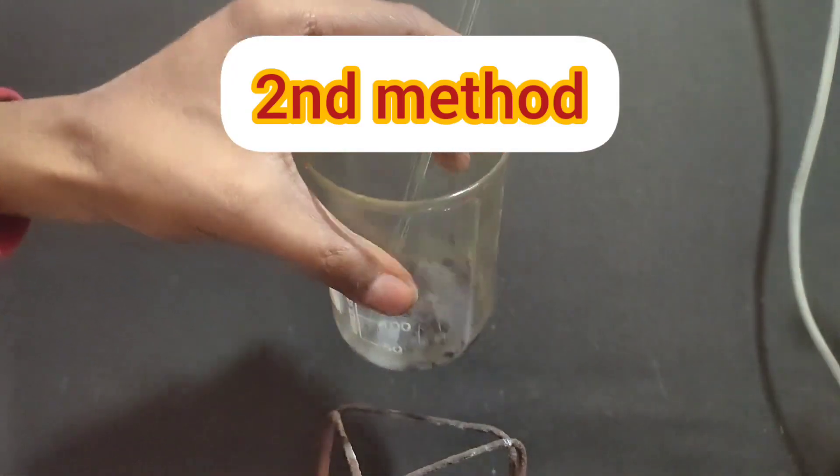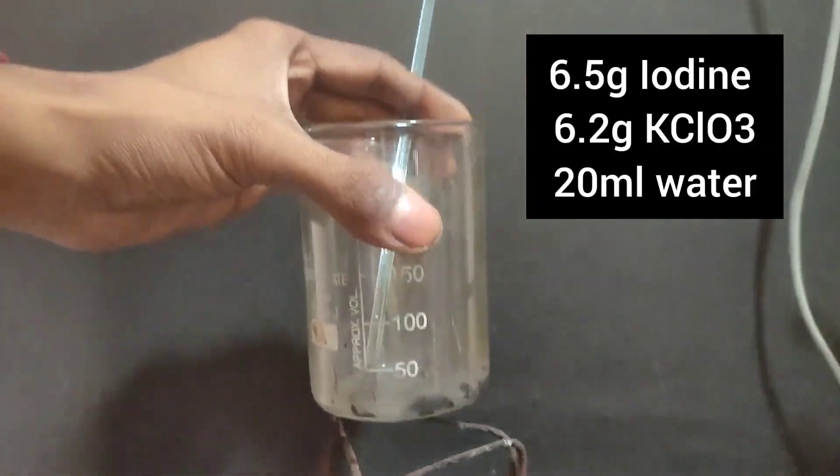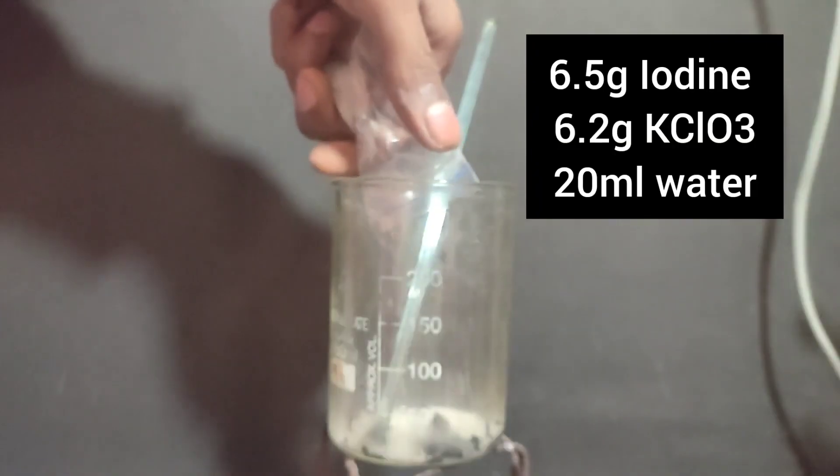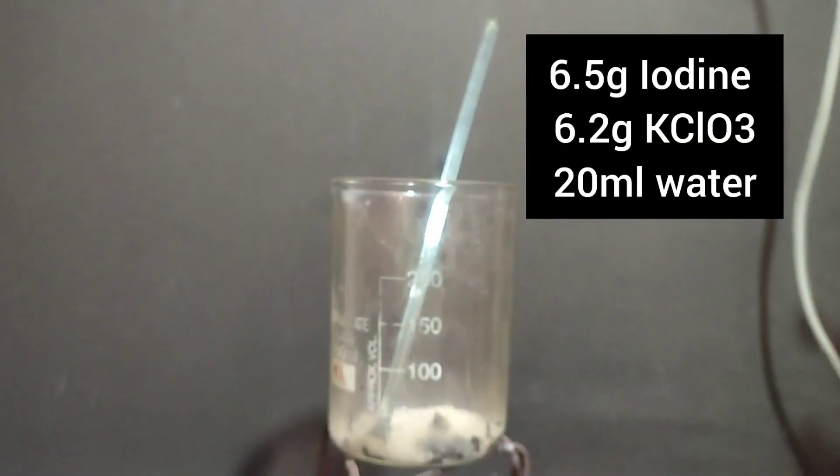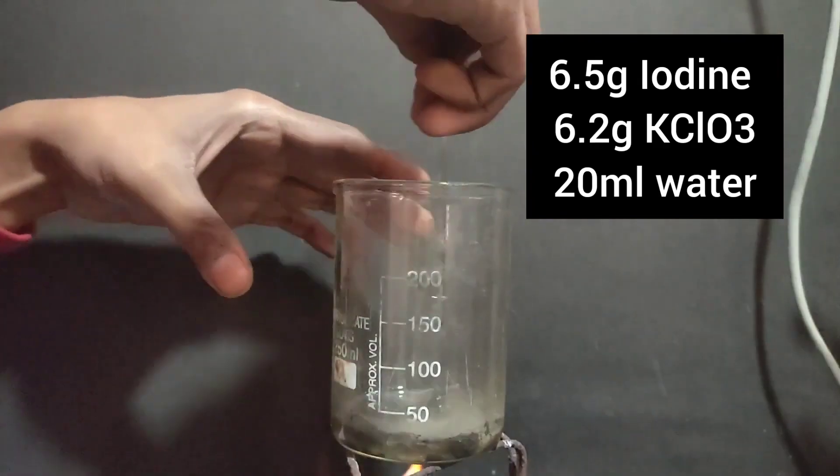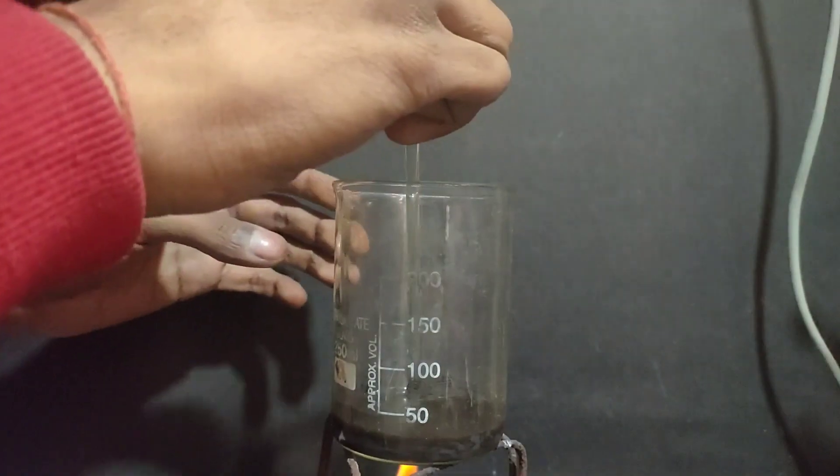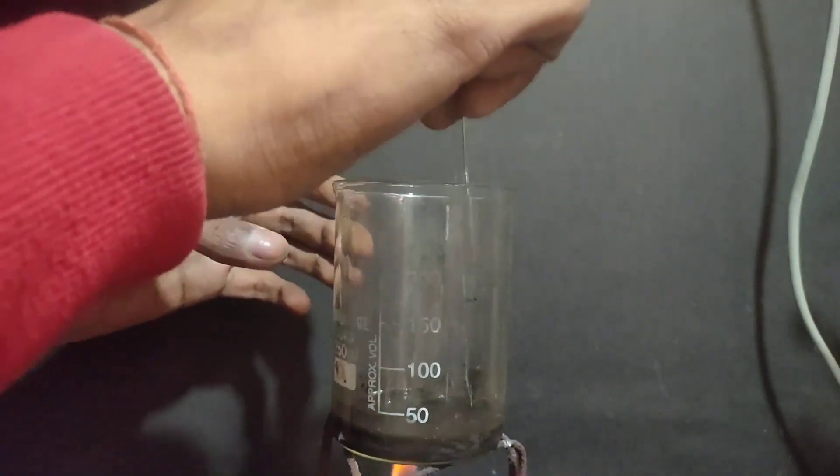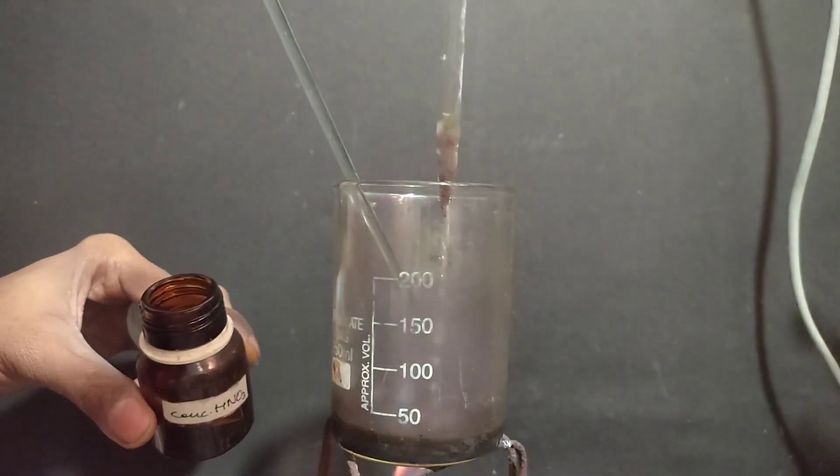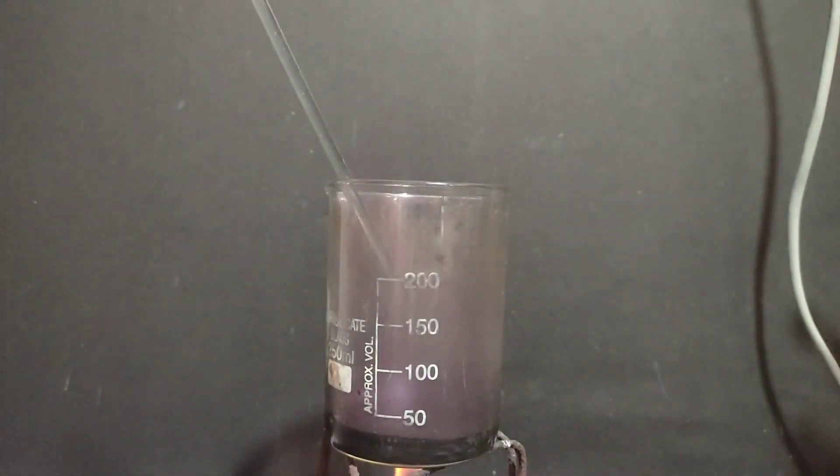Now for the second method, I took 6.5 grams of iodine in a beaker. To it, I added 6.2 grams of potassium chlorate and 20ml water. Now I started heating the solution and stirred with a glass rod. To start the reaction, one drop of concentrated nitric acid has to be added.